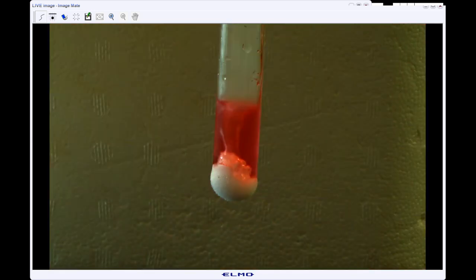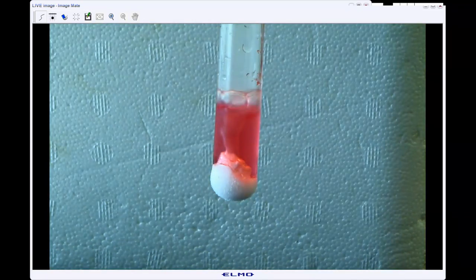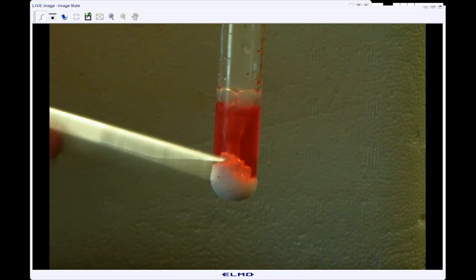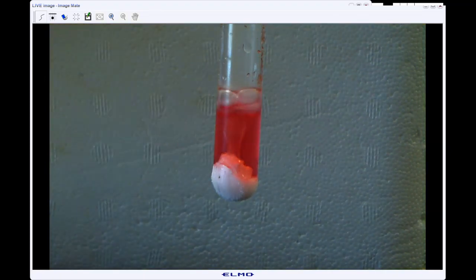If we add a couple drops, we can see that the indicator turned the liquid red. And we can also see some frost forming on the bottom of our test tube.